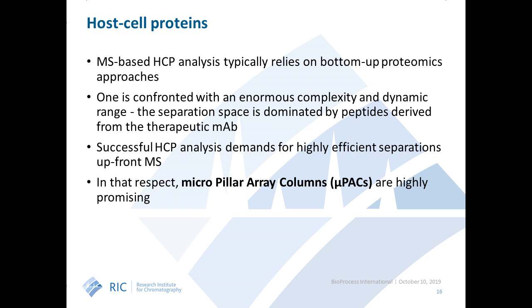Now, MS-based host cell protein analysis typically relies on bottom-up proteomics. So this means that we handle peptides that are derived from the protein, typically following tryptic digestion. And as a result, one is of course confronted with an enormous complexity and also an enormous dynamic range. And the separation space is really dominated by peptides that are derived from the therapeutic protein.